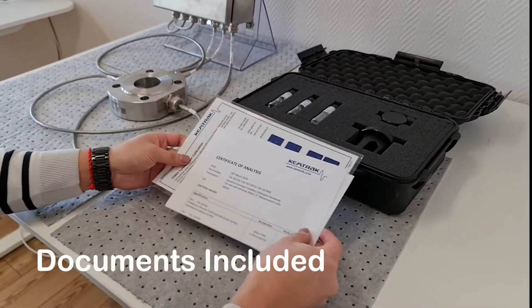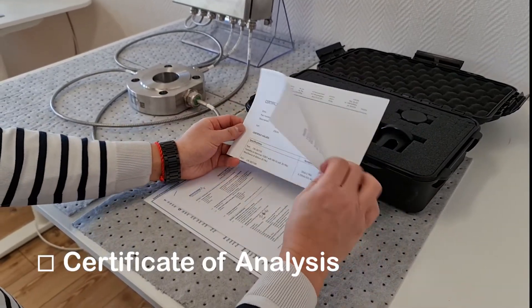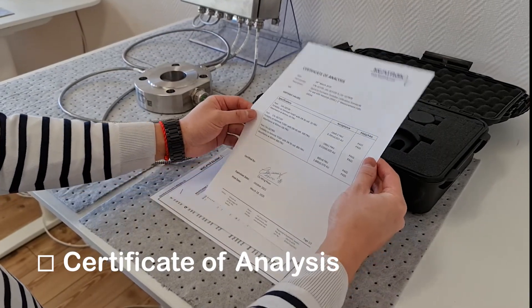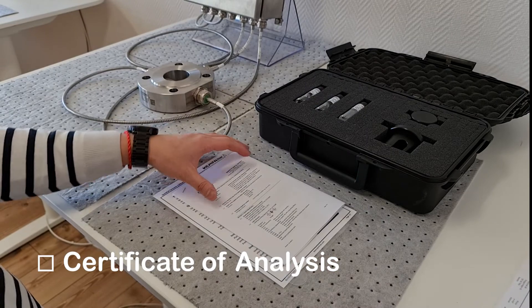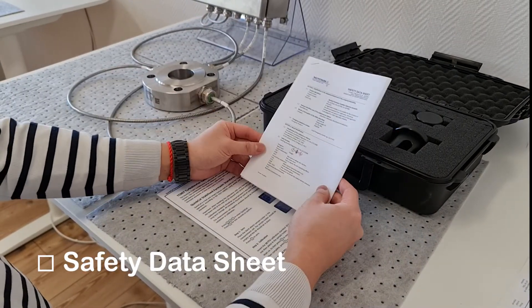The calibration kit will come with a number of documents. The first document is a certificate of analysis for the liquid calibration standards. The second document is a safety data sheet for the Formazine calibration standards.